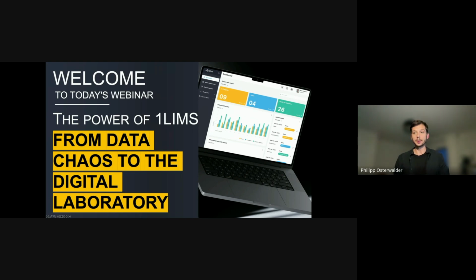My name is Philip. I'm the CEO and co-founder of OneLIMS, and I want to show you how easy it is to transform your laboratory from a data mess of paper and Excel into a laboratory data powerhouse. So welcome to our webinar today about From Data Chaos to Digital Laboratory.